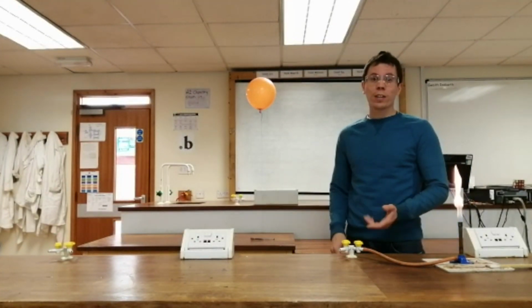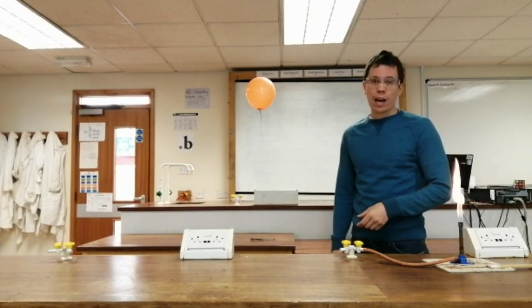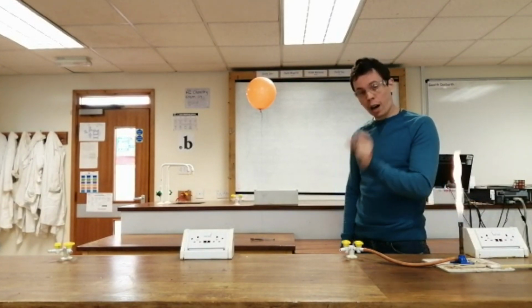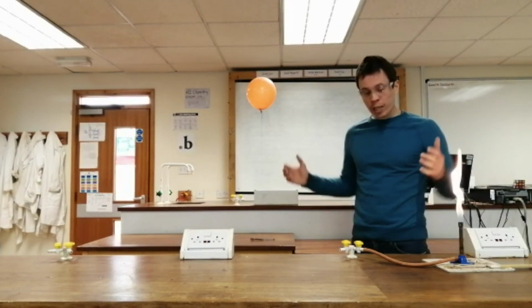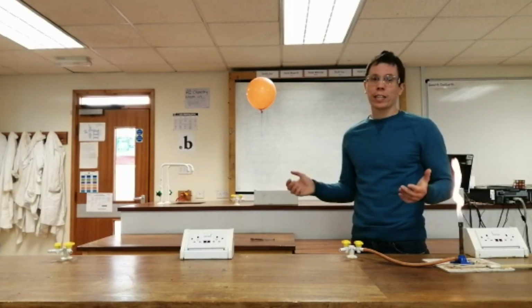Now when we test for hydrogen gas, and we put our lit splint and we get that squeaky pop, that's actually a tiny little explosion that's happening in the test tube. The reaction is between the hydrogen gas that we produced and oxygen in the air, and they react together to form water, and it gives out lots of energy that we hear as a squeaky pop.